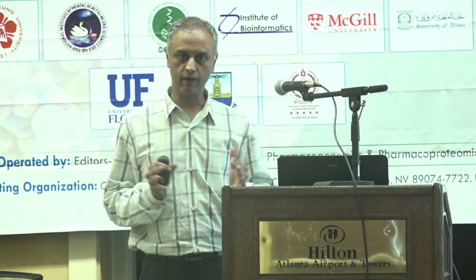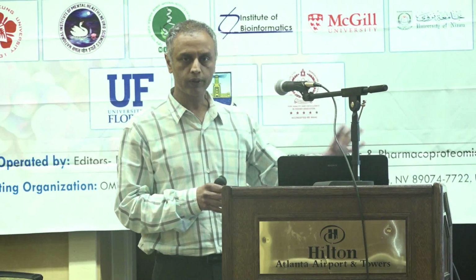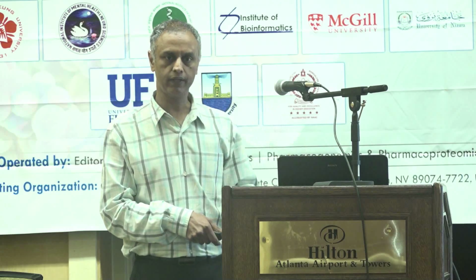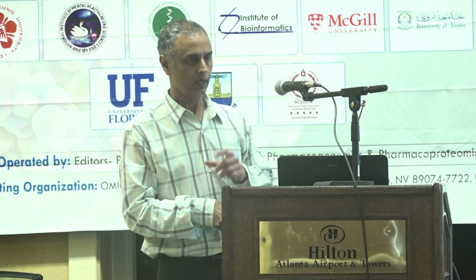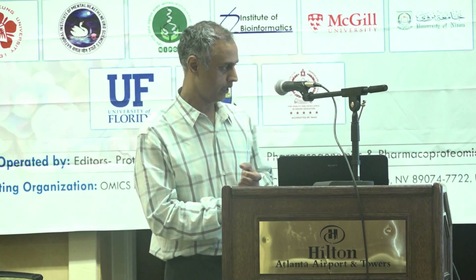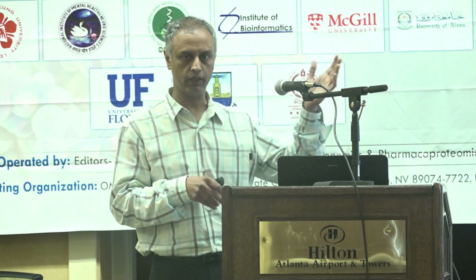So here we were using discovery proteomics, where our goal is to sequence as many peptides as we can in a short time and be able to tell what organism we have and what resistance marker they may have. Here, we have already identified the organism, so we know peptides we have sequenced from the protein that encodes for antibiotic resistance. So we have developed these targeted assays now, where the question we are asking is, are these peptides present in the sample?